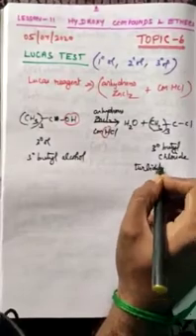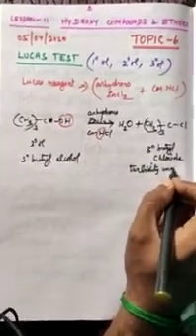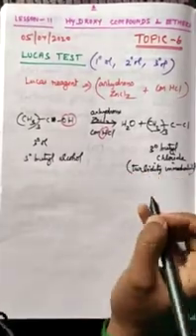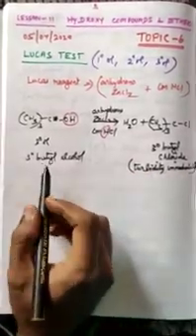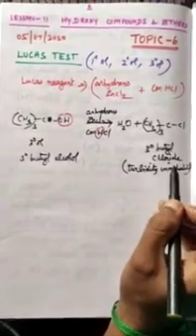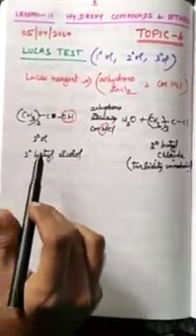What is meant by the word turbidity? Turbidity means some insoluble substance. Here alcohol is a clear liquid, but what about the product, tertiary butyl chloride? It is an insoluble substance, a white colored insoluble substance which forms as a turbidity, a sediment deposit of white color. So that is called turbidity. If turbidity appears immediately, then the alcohol we have taken at the beginning is a tertiary alcohol.